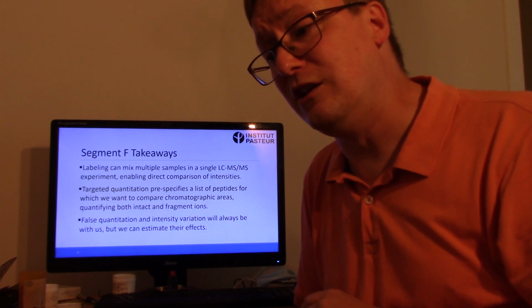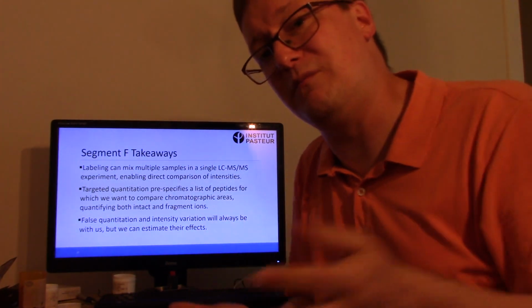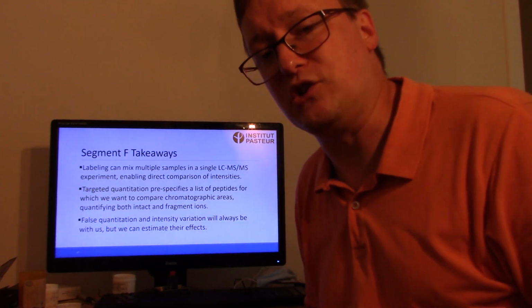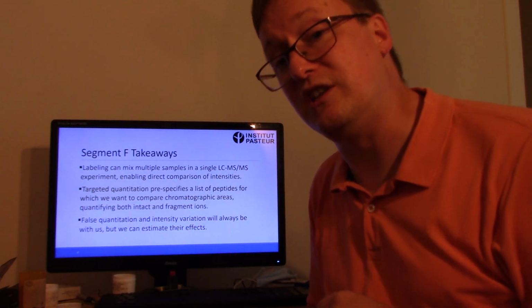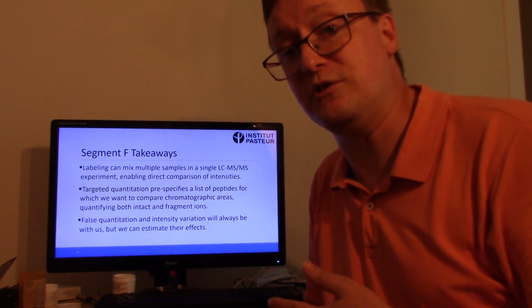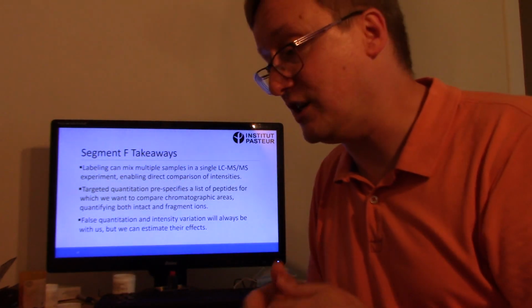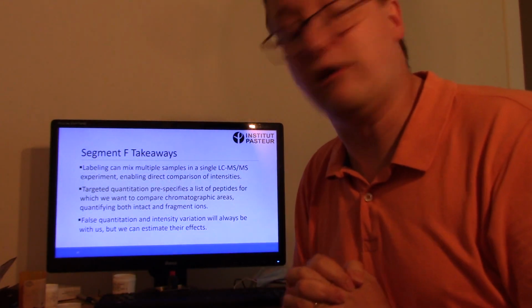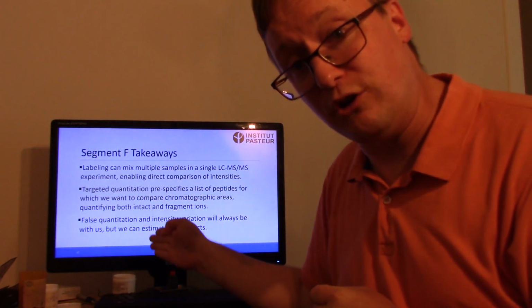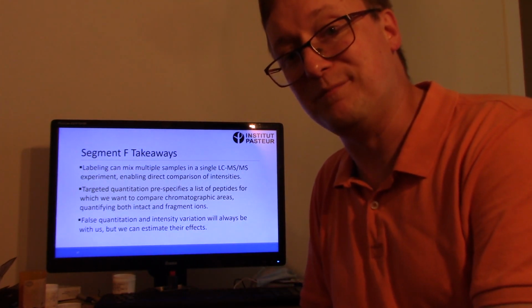In a case like that, where you're creating a measured intensity from background noise, you could certainly think of that as a false quantitation event. Being able to characterize the extent of this is quite valuable in understanding just how much to trust the numbers that come back from targeted quantitation, isotopically labeled quantitation, or plain old integration from shotgun data. We are getting better with the statistical models that we use for evaluating the data from quantitative experiments.